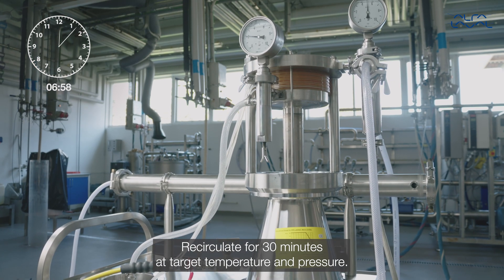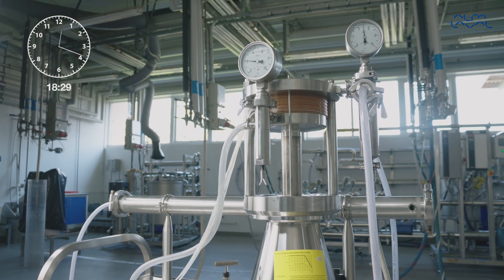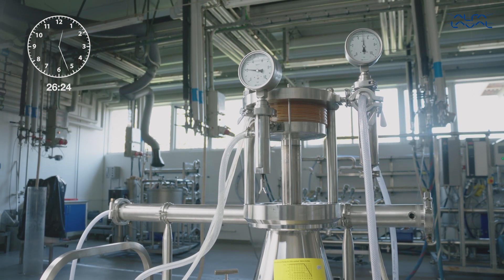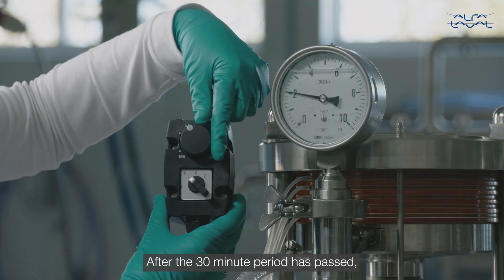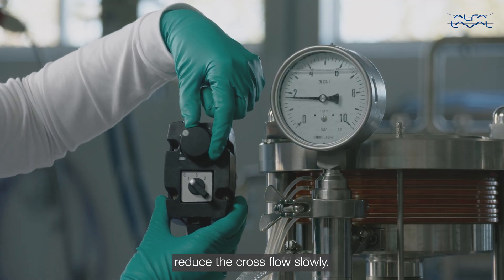Re-circulate for 30 minutes at target temperature and pressure. After the 30-minute period has passed, reduce the cross flow slowly.